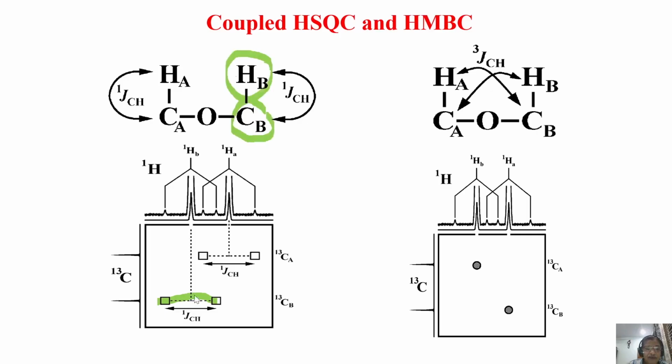And remember, this spectrum is shown. The satellite spectrum is shown by enhancing the intensity of the proton spectrum. But in the HSQC spectrum, the central peak is not there. That is absent. You only see two peaks, doublets due to carbon-proton couplings. This is what we observed and this is what we discussed.